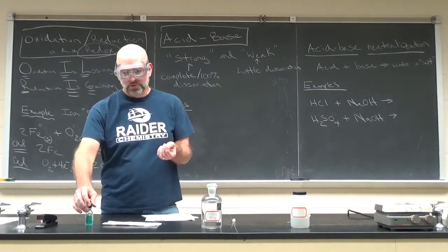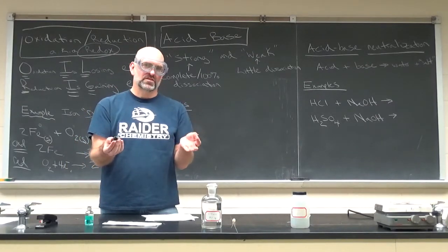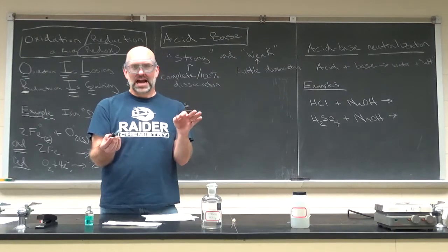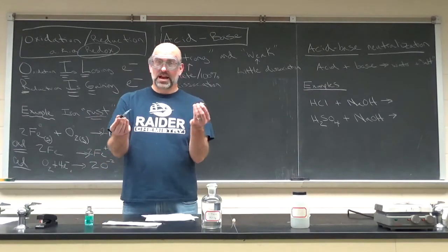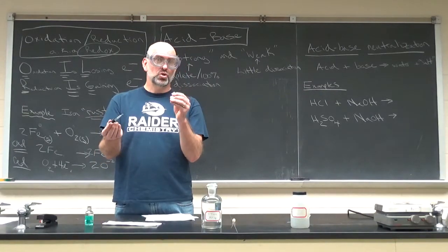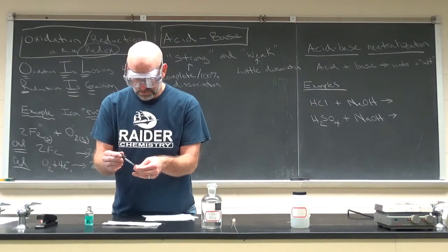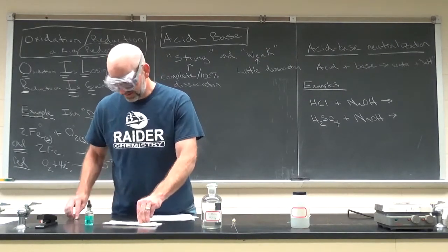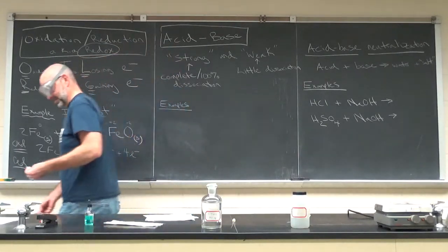Well, what are we reacting it with? Well, we're reacting it with copper sulfate, but you have to take my word for something. The sulfate is a spectator ion, it doesn't react. It's copper 2 sulfate, excuse me. So this is actually reacting, if it does react, with copper plus 2 ions. And I'm just gonna touch, there we go. That worked really well, actually.